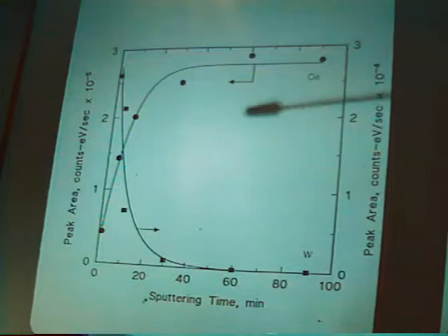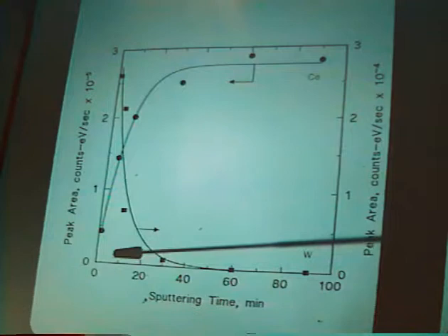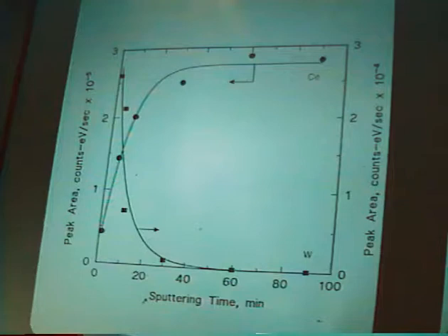At about 5 mole percent, one would expect complete coverage if there was a uniform distribution of the sodium tungstate on the surface. So this agrees with and I think supports our model of the working catalyst sample, in which we have effectively a complete covering of the cerium oxide by the sodium tungstate film.